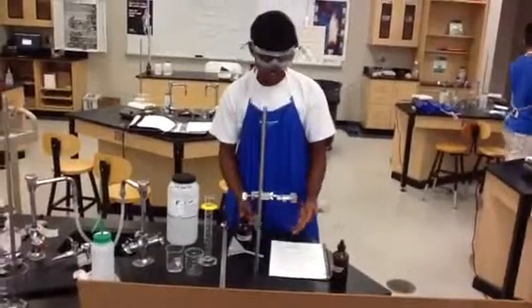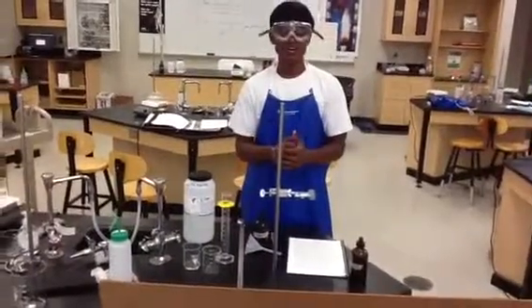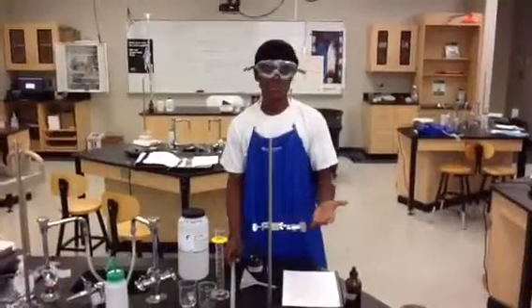Alright guys, welcome to the Titration lab. In this lab, we're going to find the molarity of an acid based on the MV equals MV formula. So let me introduce you guys to all the equipment that you will be using.